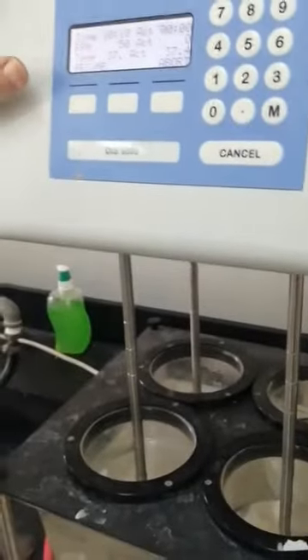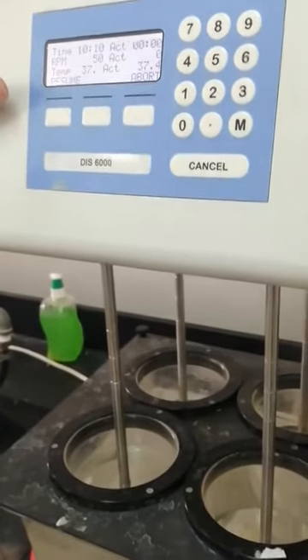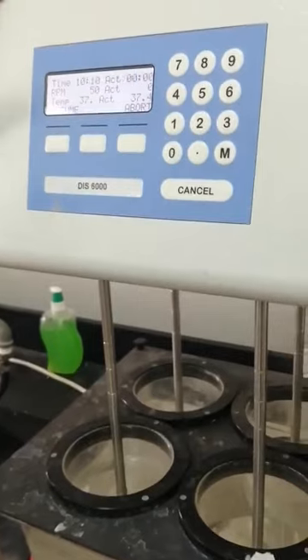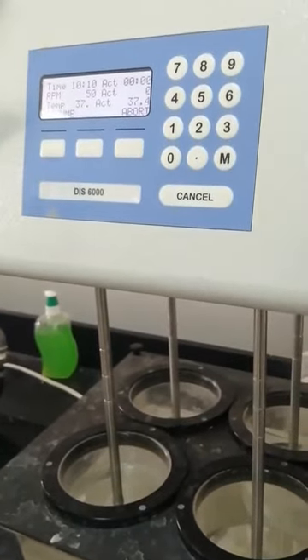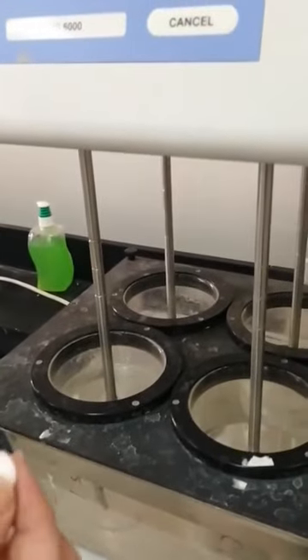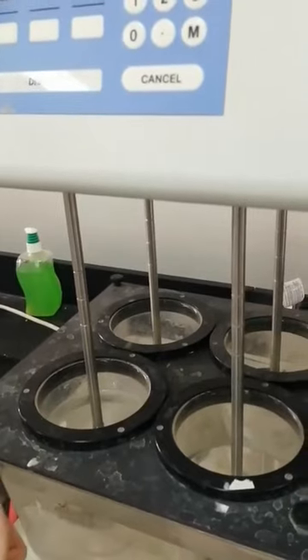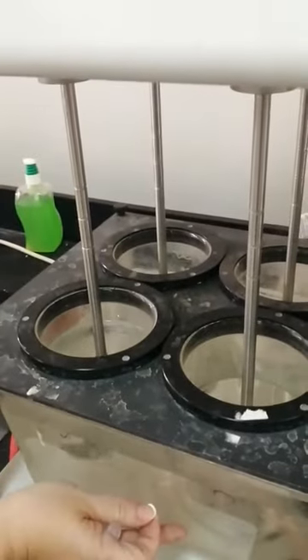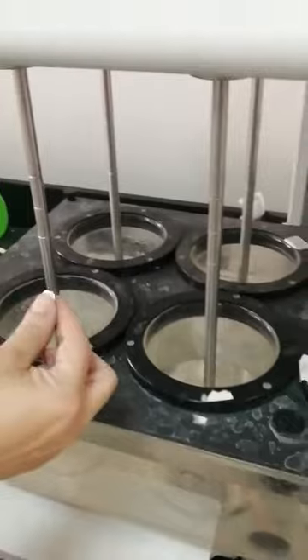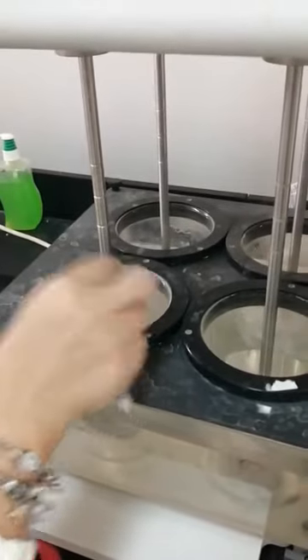I will add just 1 tablet and measure the time as 30 minutes, as we said, because at each 5 minute interval we will withdraw 5 ml from the dissolution media. So we will start by making it rotate. It's adjusted to 37. I will add my tablet and measure the time meanwhile.